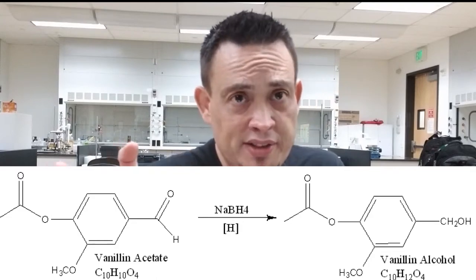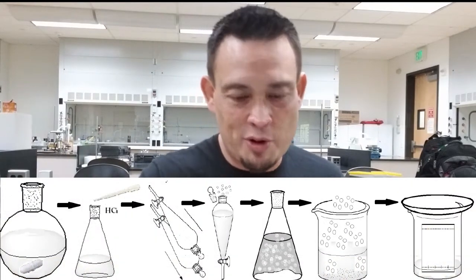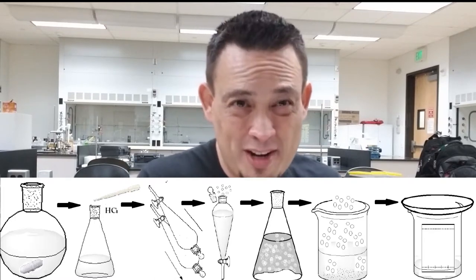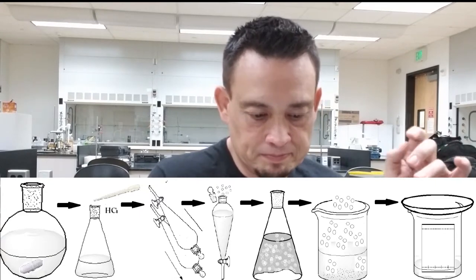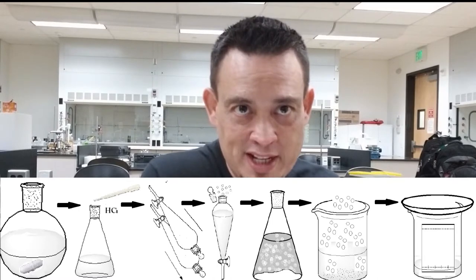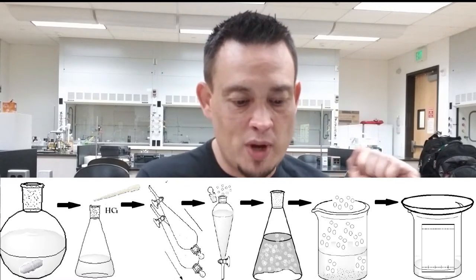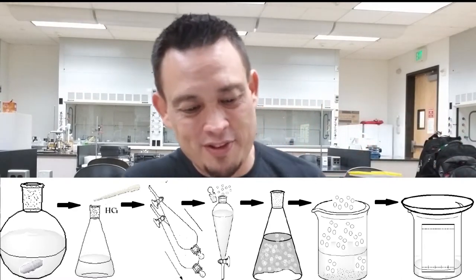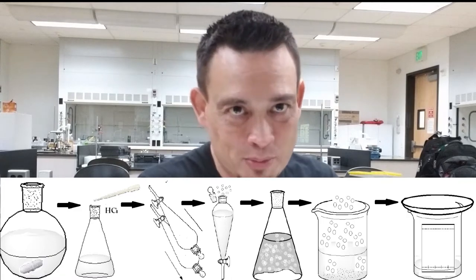Technique-wise it's really similar to last week — just what chemicals we're putting in the flask is different. We're going to throw all the chemicals in a round bottom using diethyl ether and ethanol as solvents. Using NaBH4 you've got to be careful — you'll see more detail in the actual experiment. After adding all reagents we'll spot for TLC to track reaction progress, then quench the sodium borohydride before doing a separatory funnel workup. The main difference is that at the end we're going to get an oil, so we're probably not going to do a melting point.